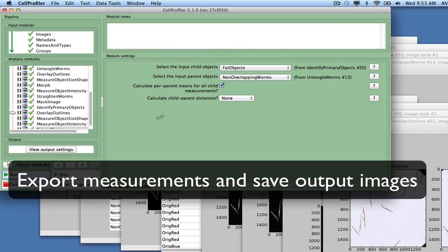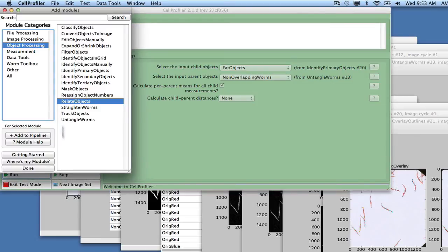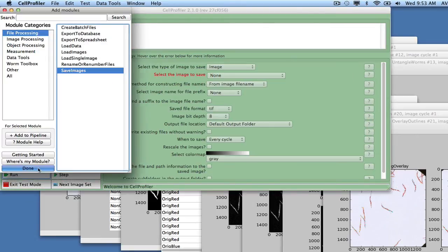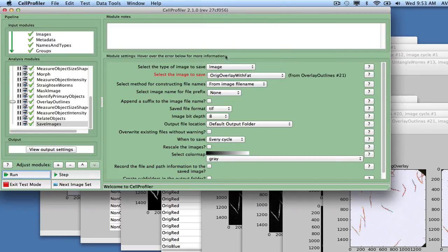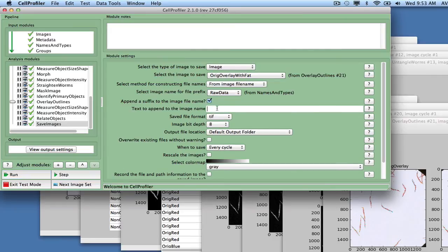Finally, we will save all measurements, segmentation masks, worm outlines, as well as the images with overlaid outlines. Add the module Save Images, and save the Ridge Overlay With Fat image using the Raw Data file name as the prefix, and Underscore RES as the appendant suffix.